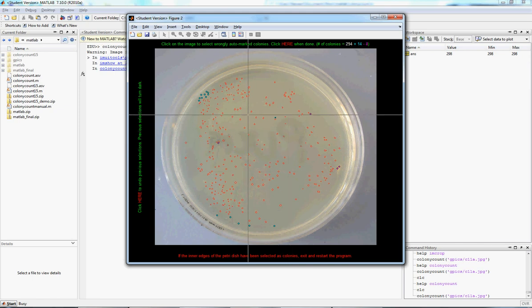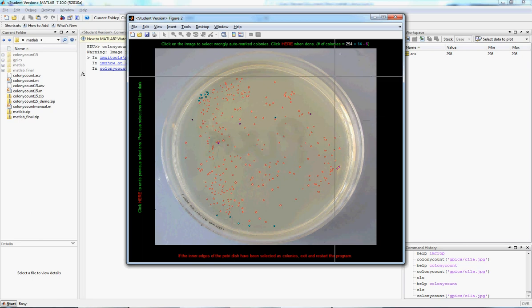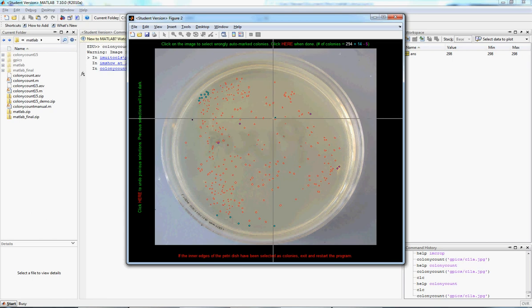And then, if I accidentally again click off somewhere that shouldn't be a colony, I can undo that and it fades, so that's not counted anymore. Went down from 6 to 5.